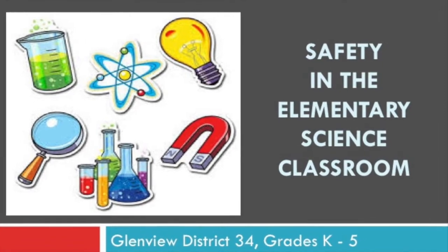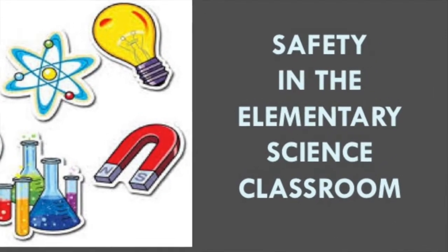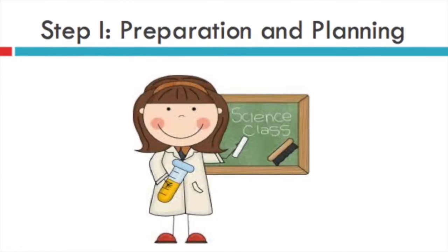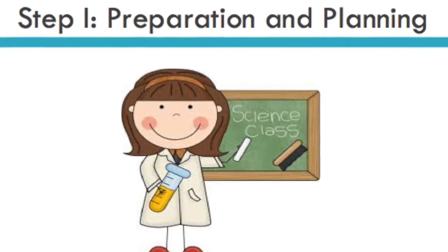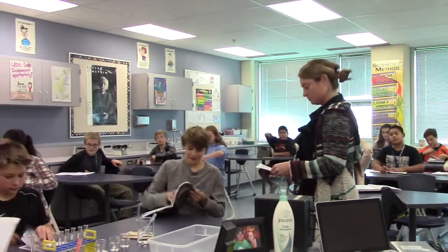This is the Glenview District 34 Kindergarten through 5th grade Safety in the Elementary Science Classroom video. Science activities in the elementary classroom are safe, provided that you and your students are aware of potential hazards and take all necessary and appropriate precautions.